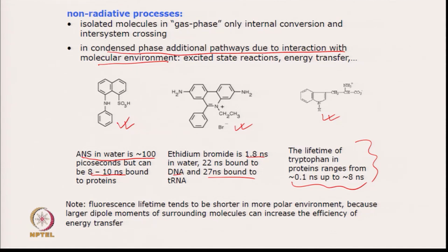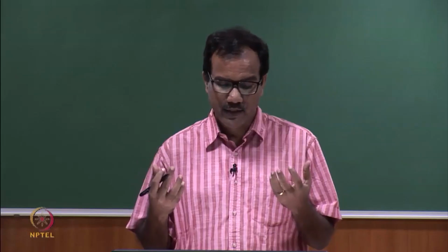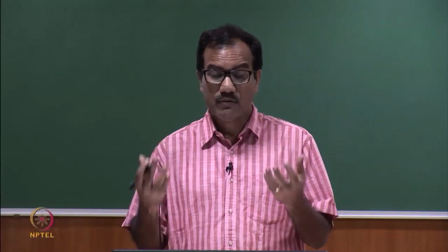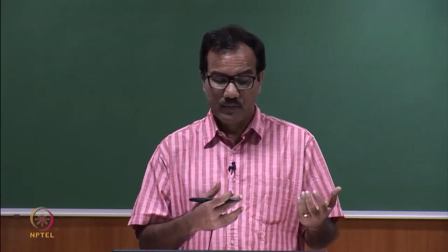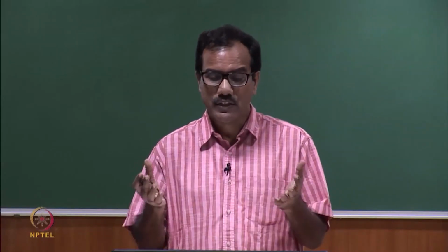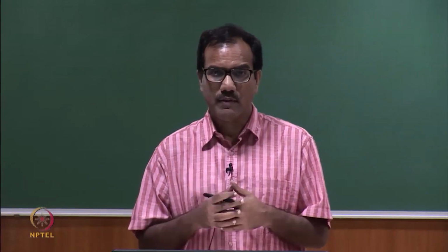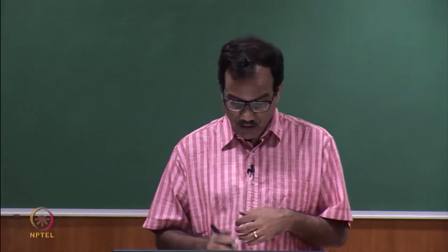So, in different conditions there will be different pathways for energy transfer, and so lifetime will be different.